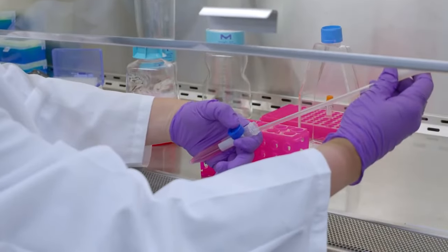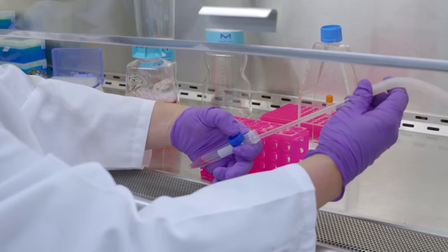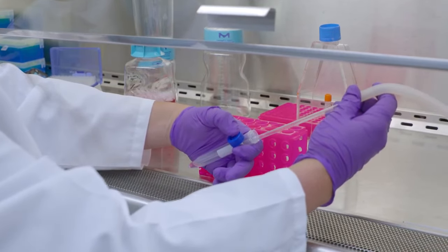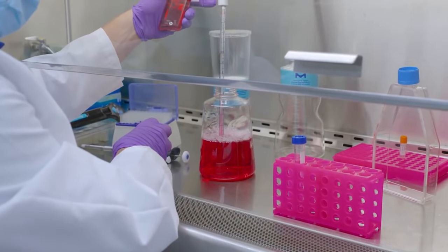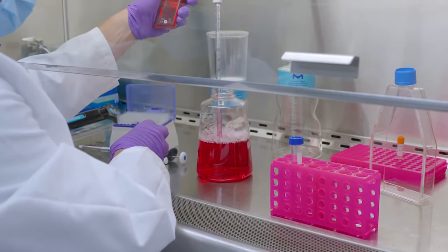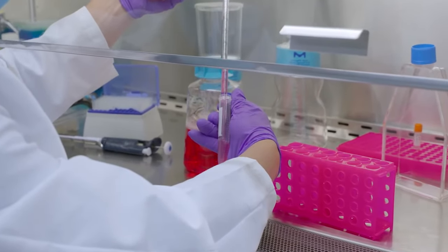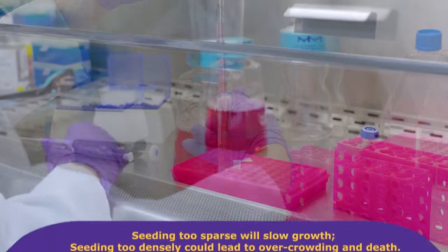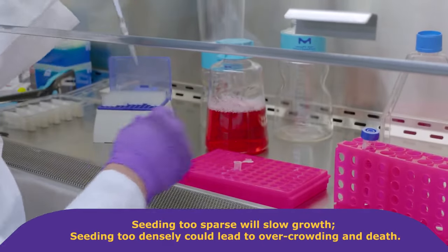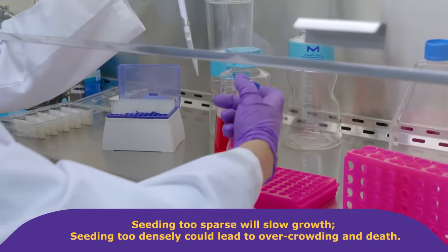Once complete, carefully aspirate the medium, making sure not to disturb the pellet. Gently re-suspend the pellet in a small volume of pre-warmed culture media. The choice of suspension volume and flask size is determined by the number of cells recovered. Seeding too sparse will slow growth. Seeding too densely could lead to overcrowding and death.